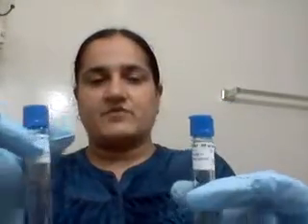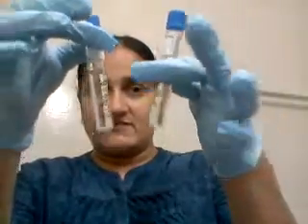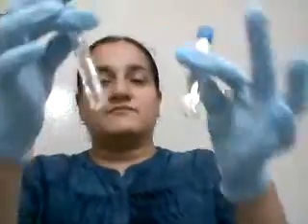And when I go to 15% for both of them, they are almost the same as when I started in the beginning. They are clear, not a single flake of growth of microbes.